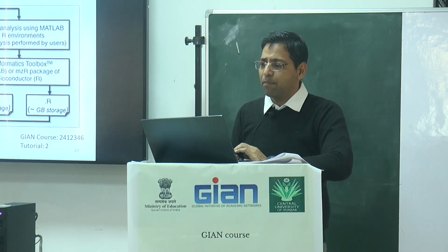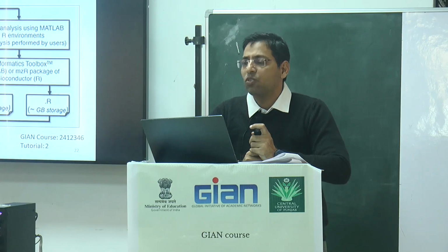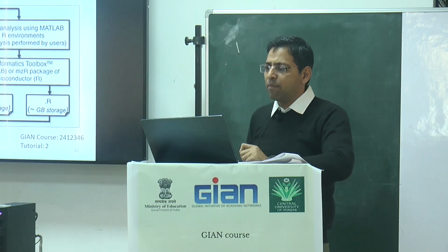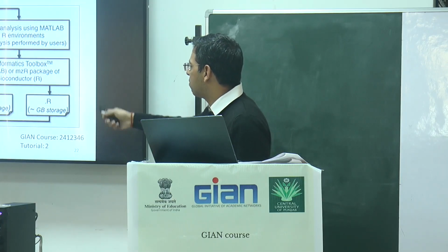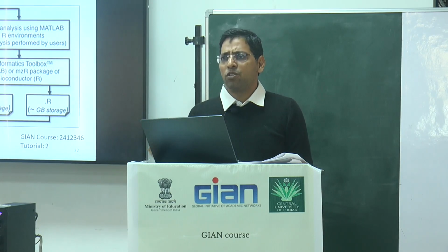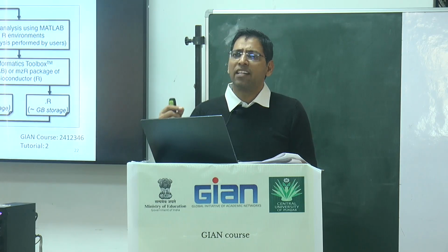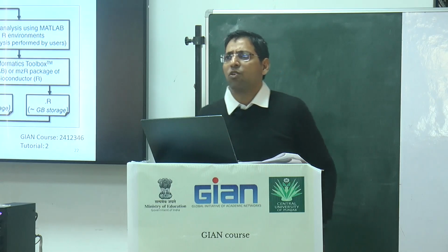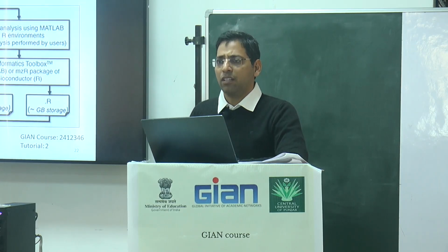So the second point is the data import. When you get the data for the untargeted analysis, one is software which converts to the open formats. Also, data need to be imported into the analysis platform actually. So data import is the way by which data can be used directly by the bioinformatics tools. Initially it has many GB of data, but when you import, finally you reduce the size of those files and get a file which can be used by the different bioinformatics tools. Because every tool requires a particular extension or some unique information of those data. So data import is a very key, important step for non-targeted metabolomics.